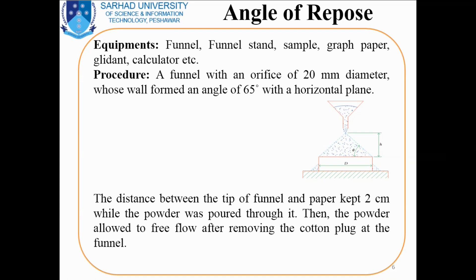The powder will form a heap on the horizontal plane where we have already placed graph paper in order to determine the diameter. When the powder stops flowing and touches the tip of the funnel, we will determine the height of the heap and the radius of the heap. By putting these values into the formula theta equals tangent inverse 2h by d, we will determine the angle of repose.